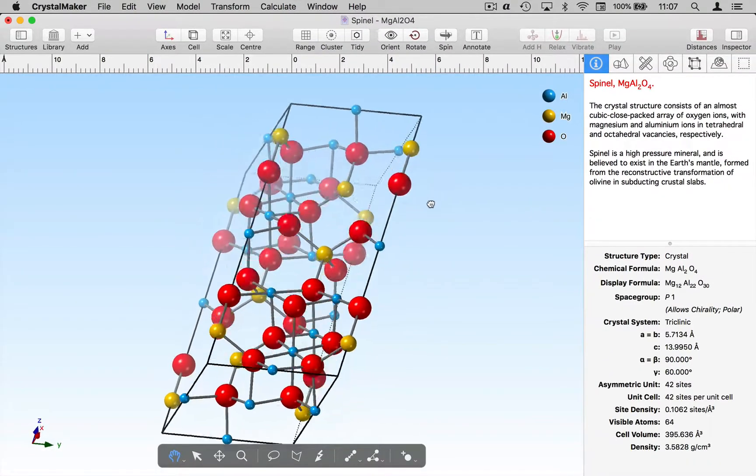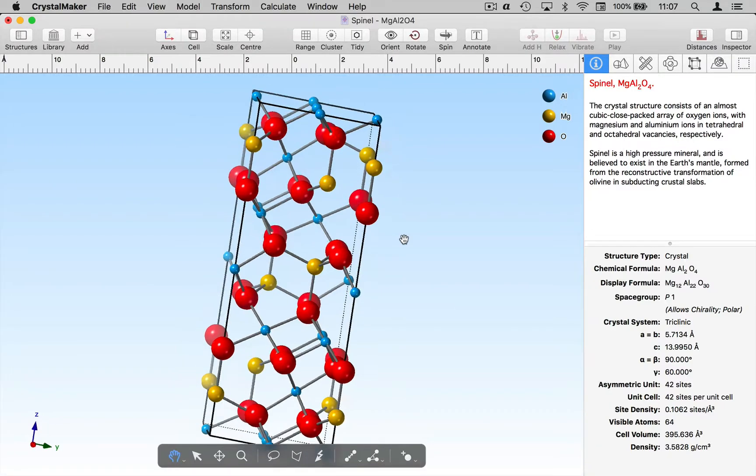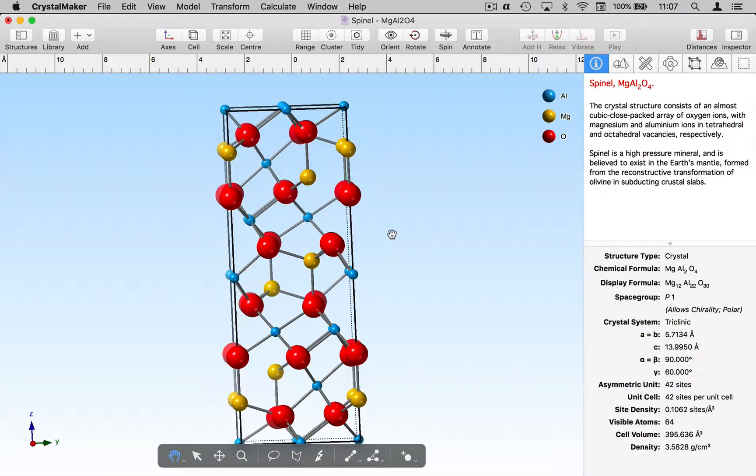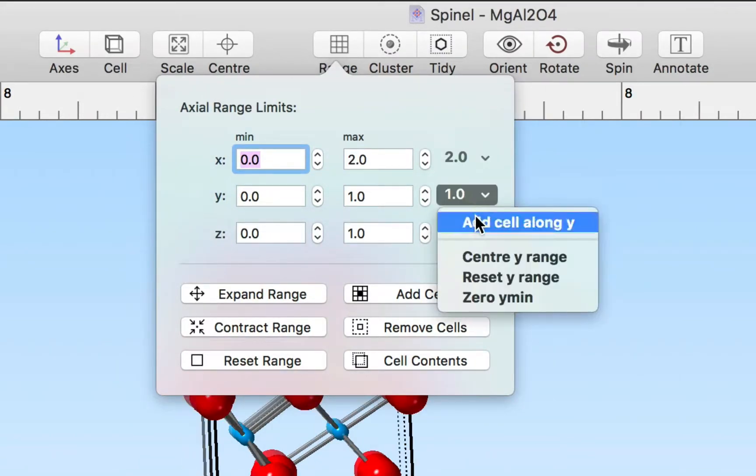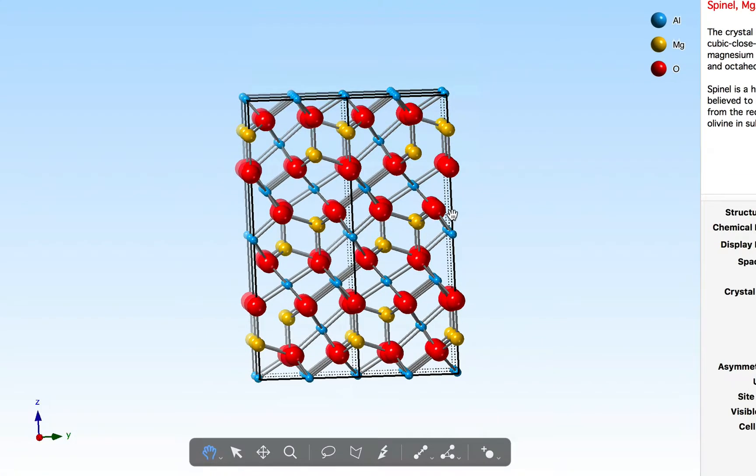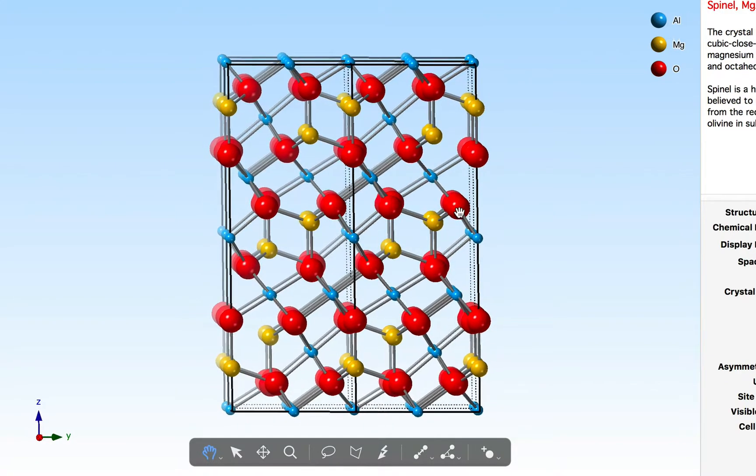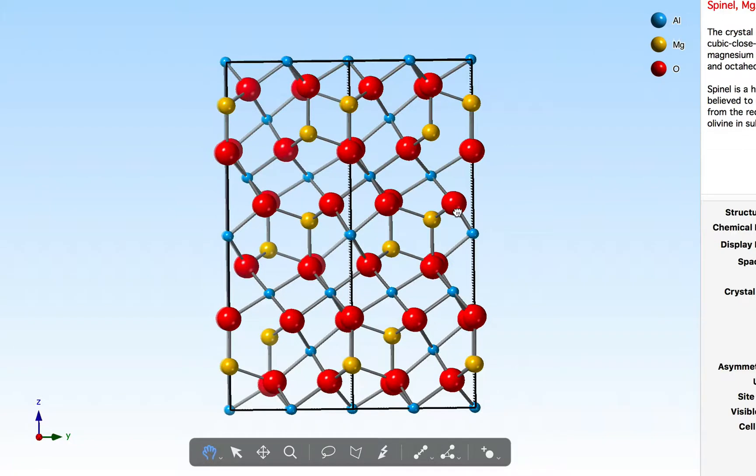This is my surface cell that we just generated and if we look along the z axis we can see we've got these layers of oxygen and I can make that clearer by extending the plot range along x and y. And now we can see this is a new unit cell, the z axis is approximately perpendicular to the close-packed layers.